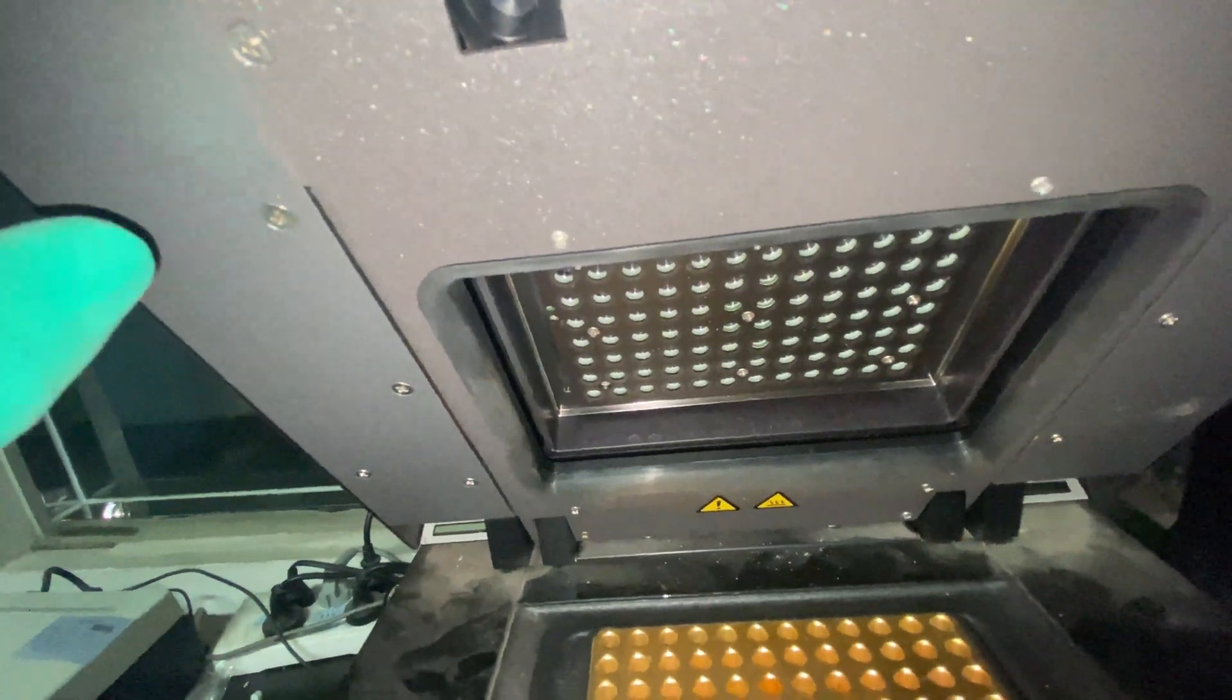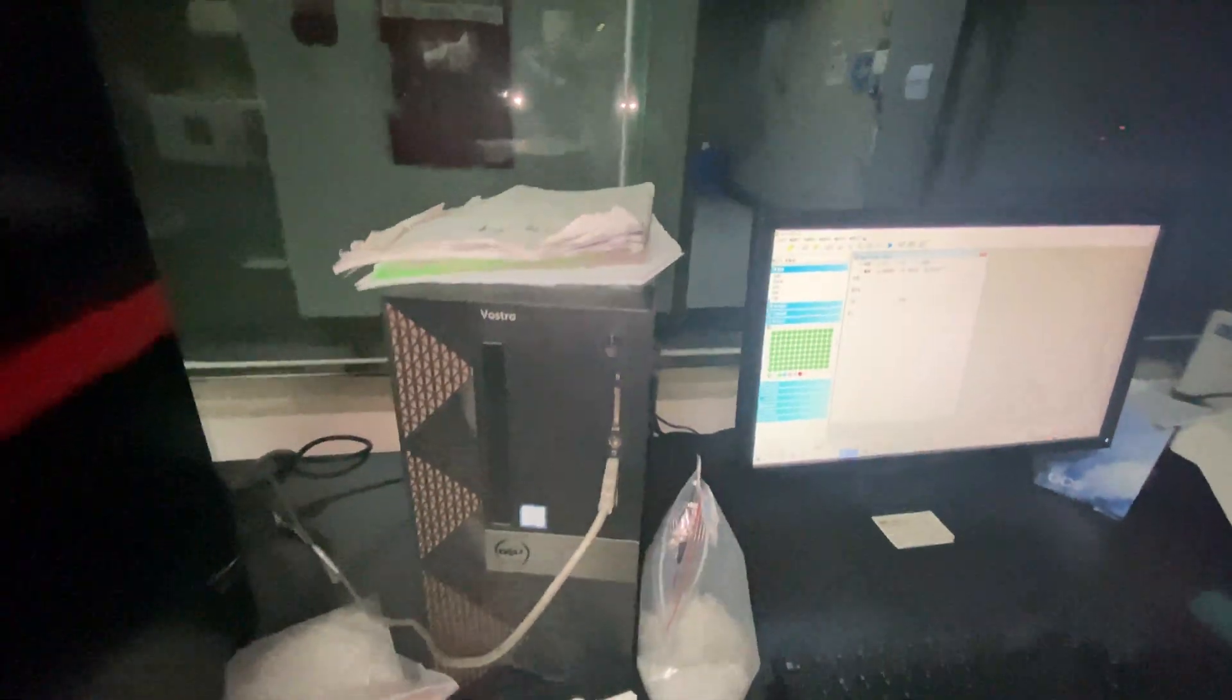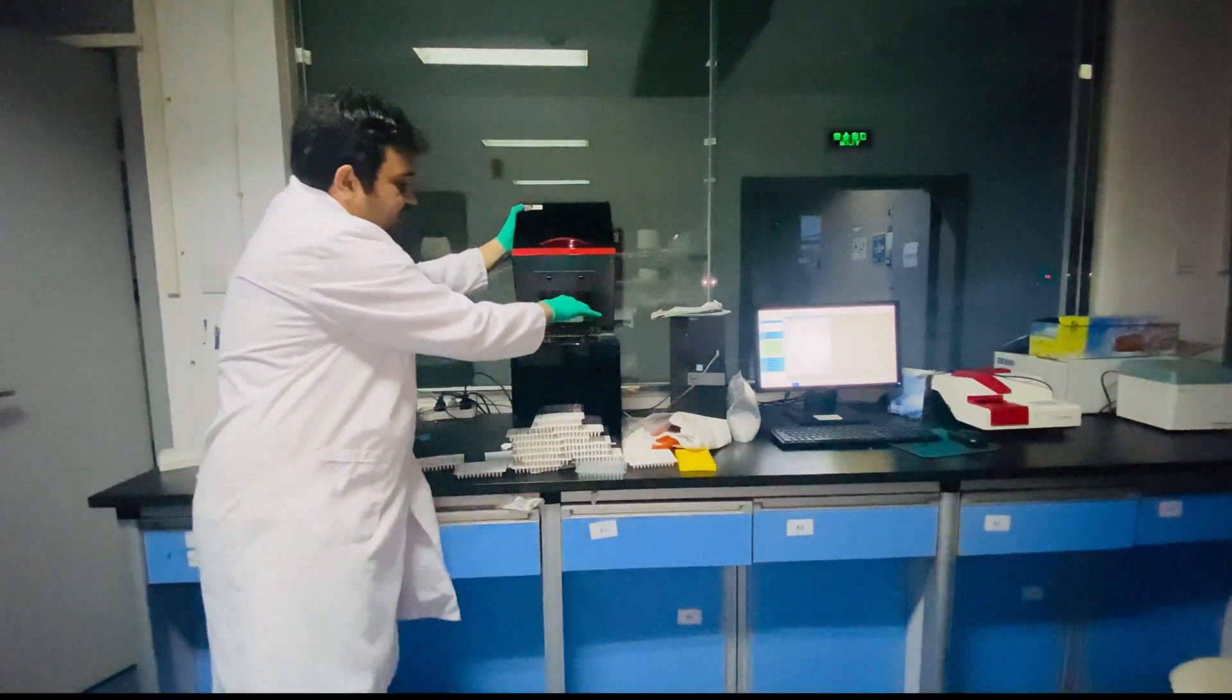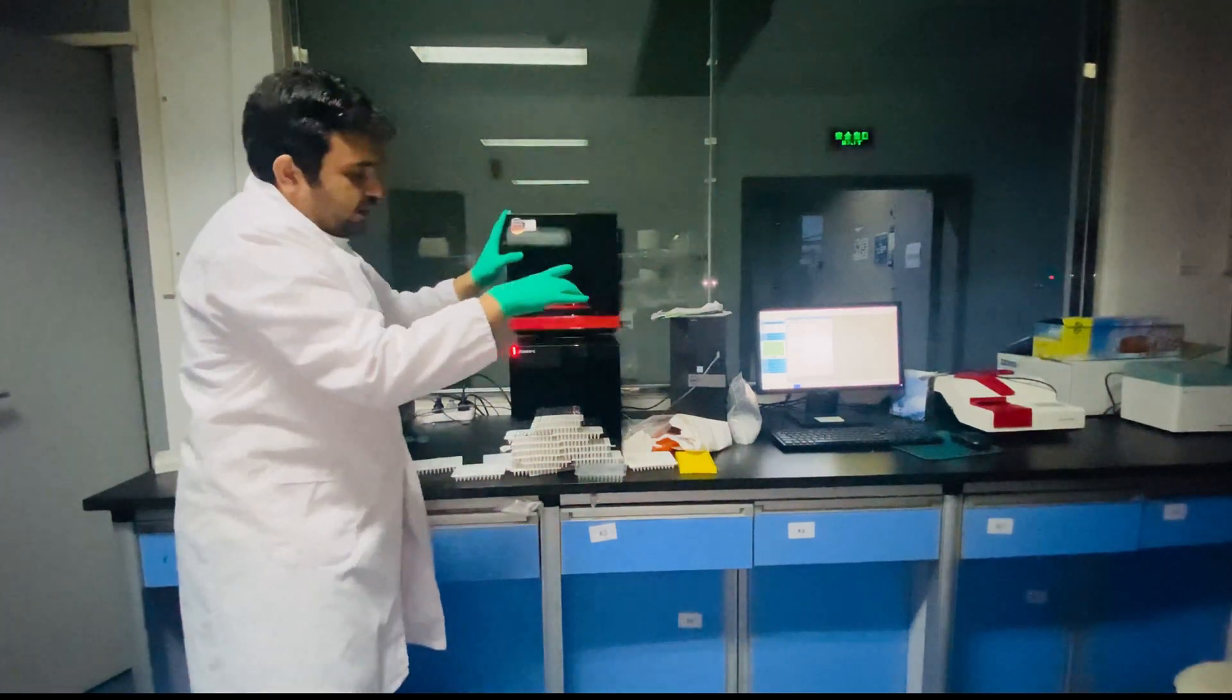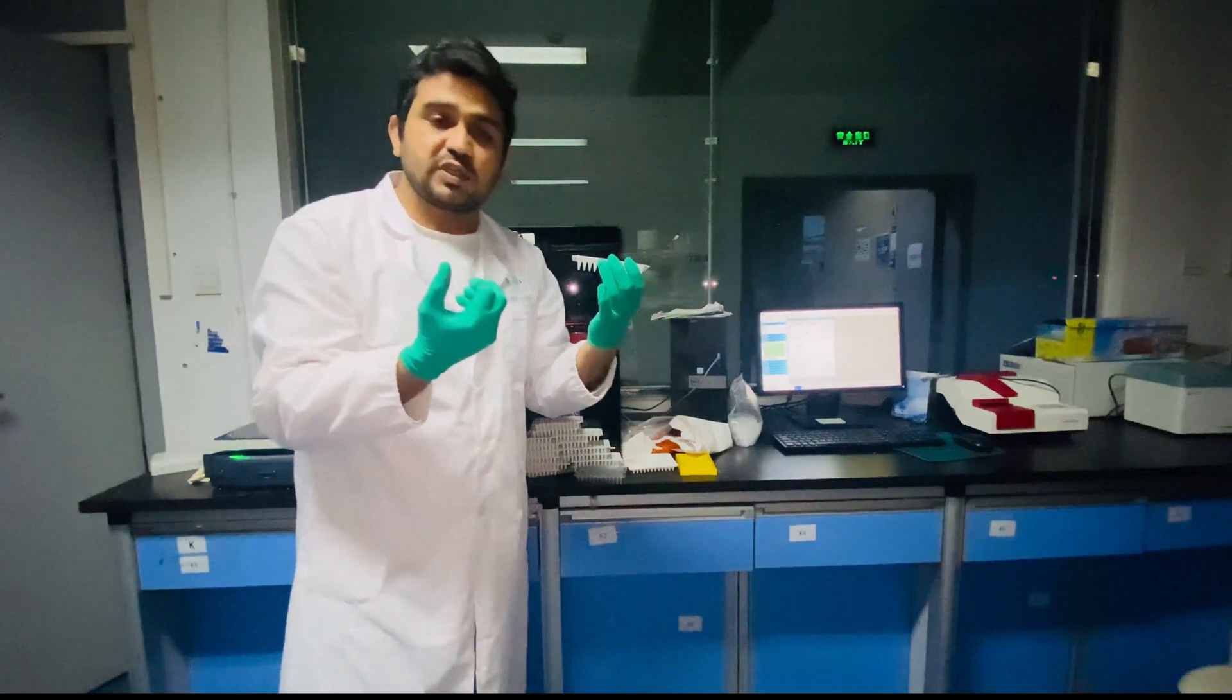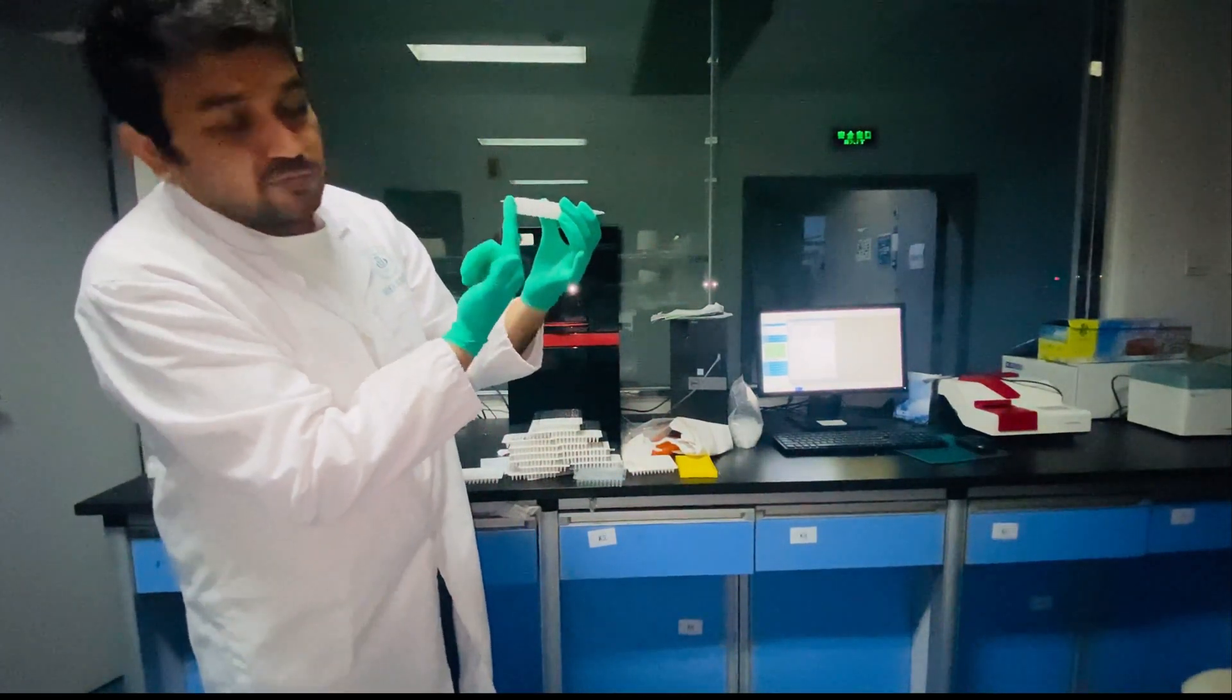Those sensors record the values in the form of curves that are processed by this software. The 96-well plate fits into this hole. All the gradients of PCR are usually at the bottom of the side.